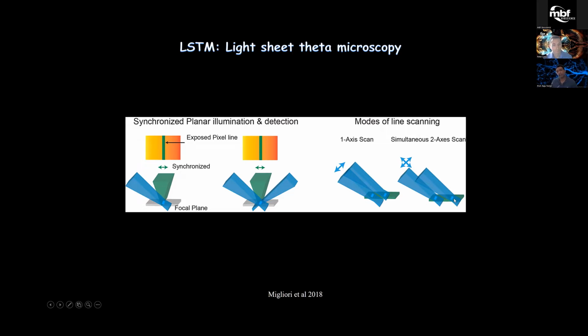So we can get this high quality throughout the plane, as opposed to losing quality on the edges, which is also the case in standard light sheet implementation. But more importantly, this also allows us to now use higher NA for light sheet illumination to generate thinner sheets, because we are not limited by that trade-off. So we can get much higher axial resolution as well.